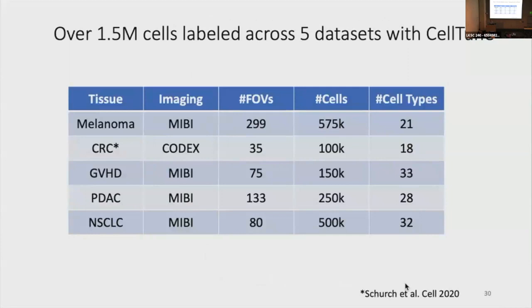It's totaling over 1.5 million cells, where we're running this process until the disagreements are really ambiguous. So the user just stops, and then we have these data sets which we're very confident in the labels, and this will be hopefully a good resource for the further development of more deep learning approaches and things like that.